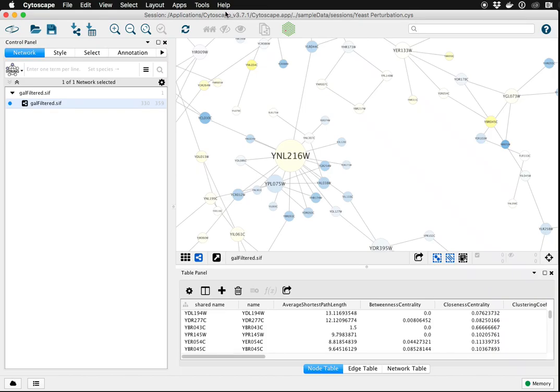This is Cytoscape 3.7.1, and I'm going to demonstrate how to manually add nodes and edges to either a pre-existing network or to a blank network that you want to draw from scratch.